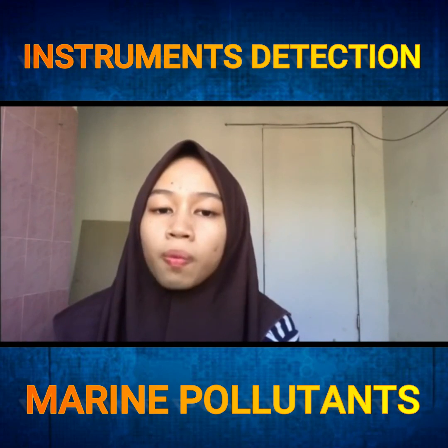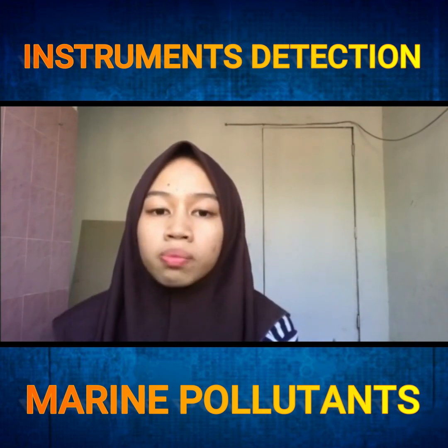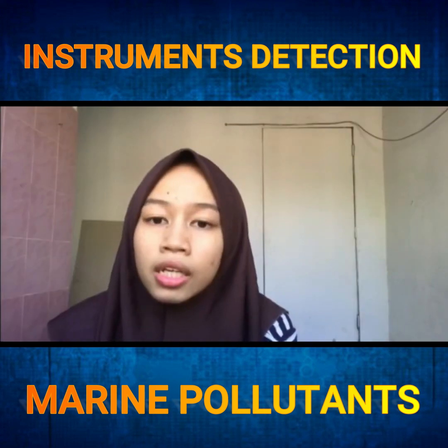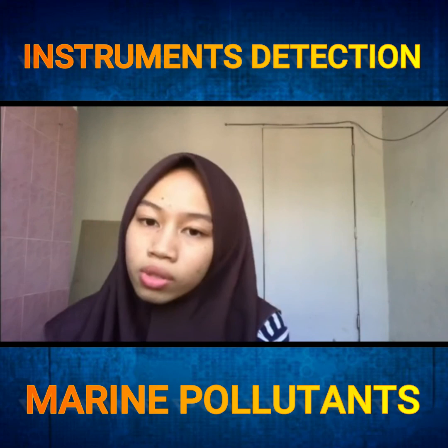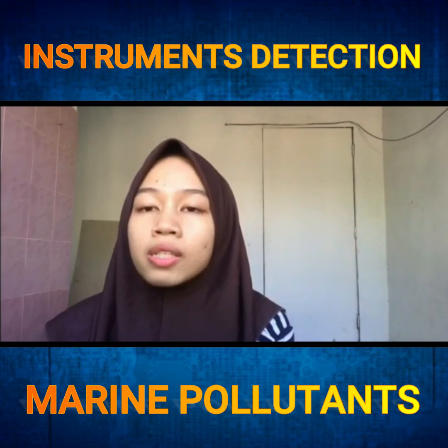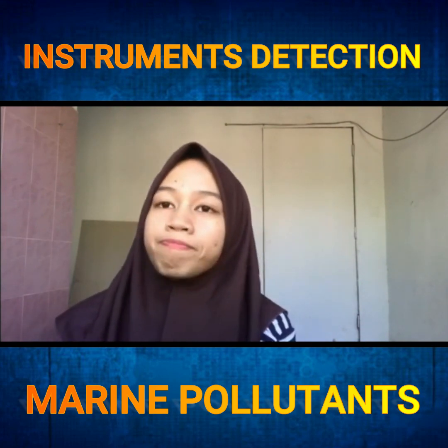So how does this VIP system work? The sample is pumped through the cell, and trace metals are reduced and pre-concentrated or deposited in the Hg film. After deposition, usually between 5 to 30 minutes, the metals are reoxidized at the specific reduction potential, producing an anodic current directly proportional to the concentration of trace metal in the sample. That's how it works. So this VIP system is robust and reliable because in situ measurement of the mobile fraction of trace metal can be achieved down to a very low concentration level. Okay, that's it.